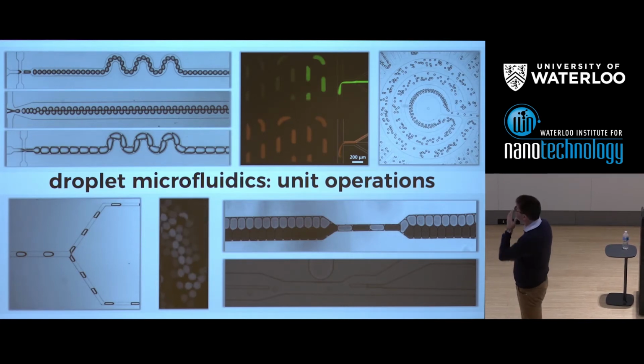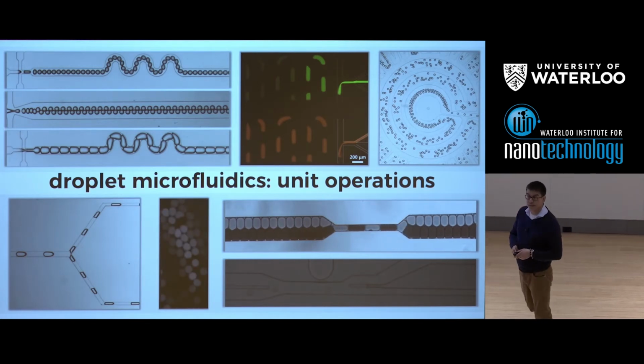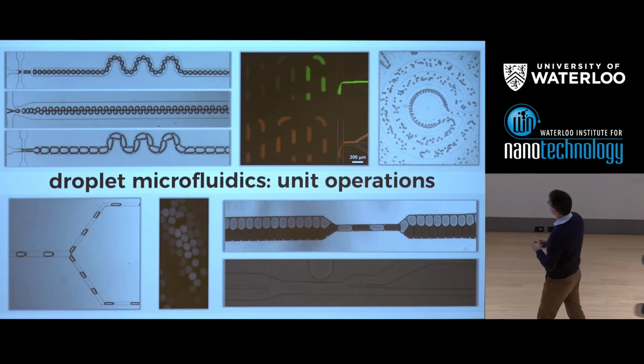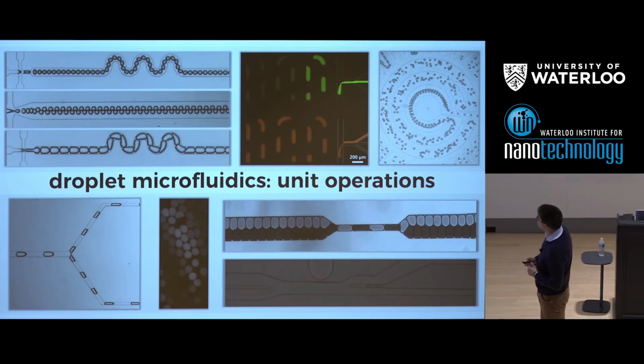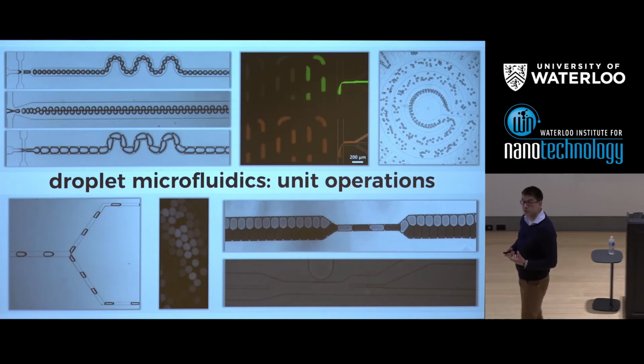Now, this is particularly important for biology. We can synchronize droplets into particular orders, and then work here, which you would have heard about when Dave Weitz spoke here at Waterloo, because this is a device that was developed by his group, and we've simply duplicated this for our experiments. It is a device which allows us to sort droplets.